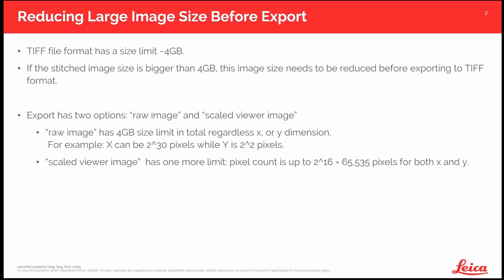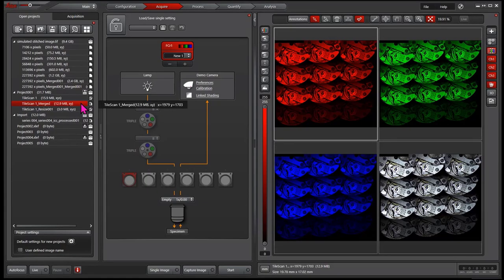Usually for presentation or publication, you do not need the full resolution of the stitched image anyway. So we will export the stitched image with reduced size. There are two ways to do it.